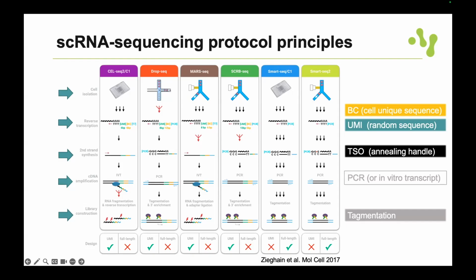So the unique combination of these 8 random sequences to a specific gene occurring twice in this big set of random UMIs is highly unlikely.